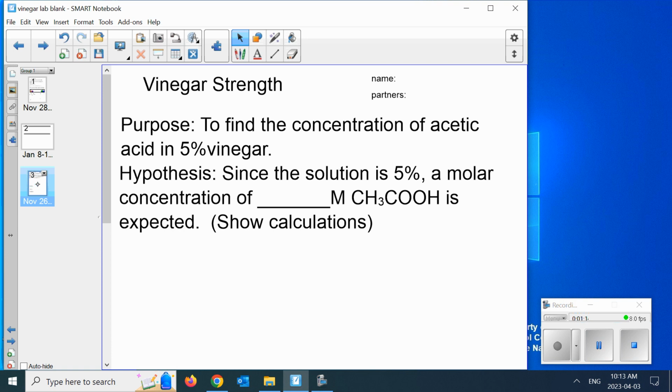Now, significant digits. When it says 5%, is that 4.5% to 5.4%? Like, you know what I mean? Is it because it's just one digit, right? How accurate is this 5%? First, from a consumer point of view, or from a science point of view, it's like I said, anywhere between 4.5 to 5.4, right? You can assume it rounds to 5.